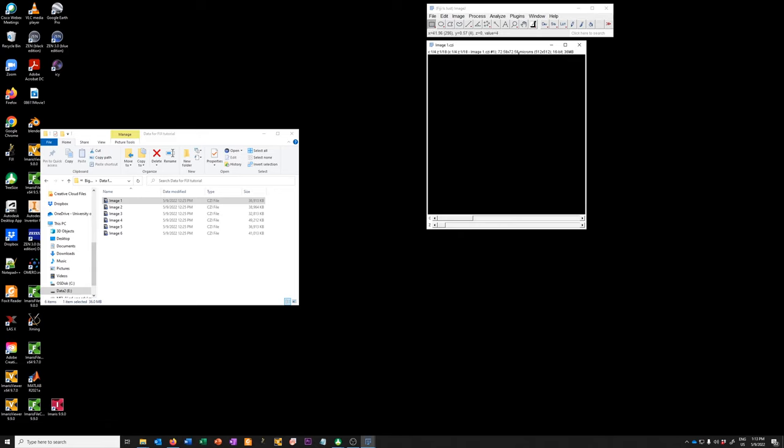For every pixel in a single Z-plane there is an intensity value — a number proportional to how much light came from the location represented by that pixel. Larger numbers mean a higher concentration of fluorophore, or a higher laser intensity hitting the fluorophore, and ultimately they're connected to what the fluorophore was labeling. For example, this channel has DAPI, and a high number means there was a lot of photons from the DAPI at that location, presumably because there was more DNA for the DAPI to bind to.